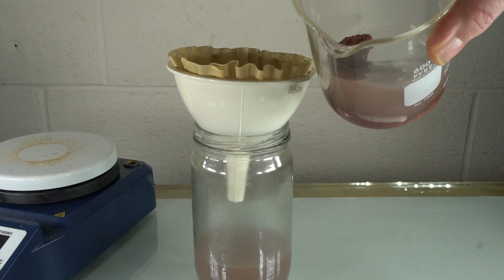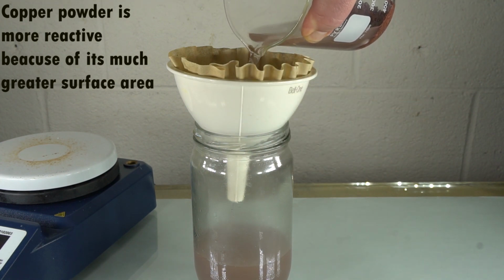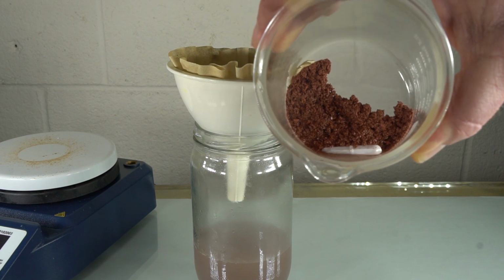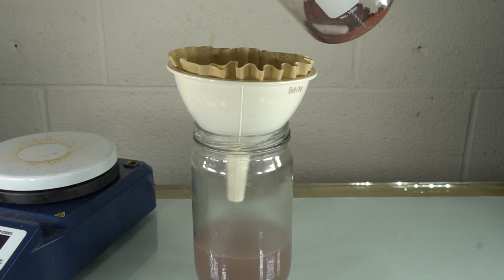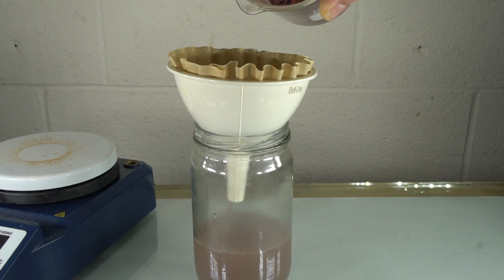So I don't know if you can see in there that copper powder at the bottom. That copper powder is so heavy, it just, there we go. Look at that. You can see it. It's really nice, reddish brown. Let's see if we can see. It doesn't even want to come out. None of the copper came out.